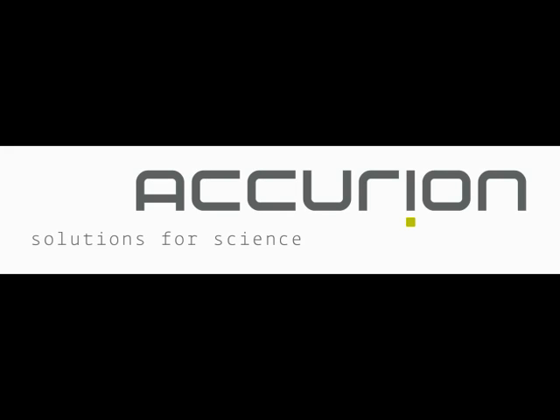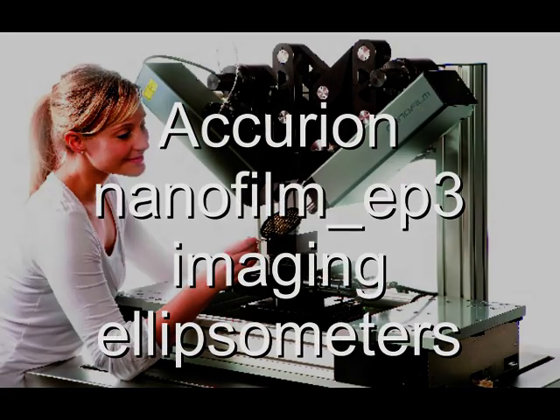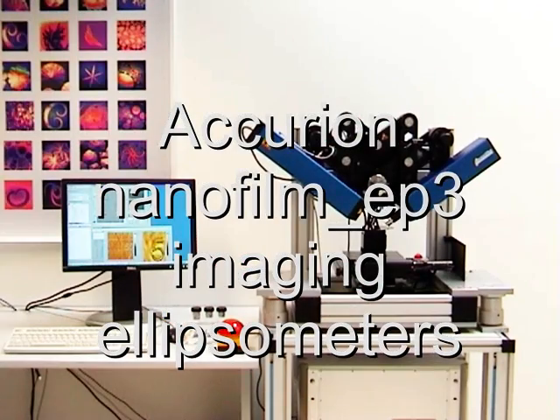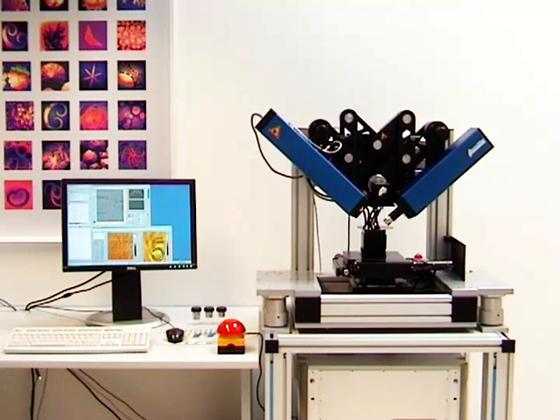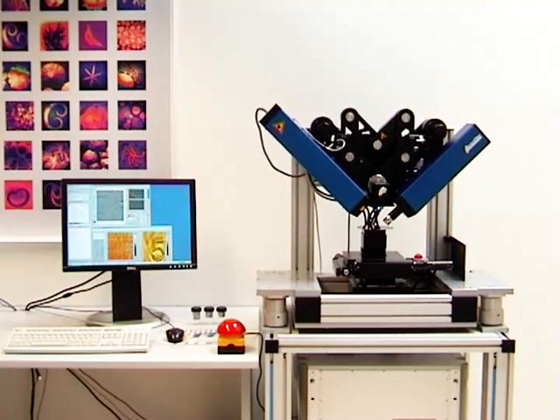State-of-the-art Imaging Ellipsometry. Imaging Ellipsometry is a versatile tool for surface analysis. The EP3 combines ellipsometry with ellipsometric imaging for maximum lateral resolution.